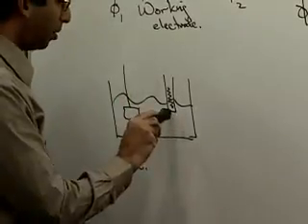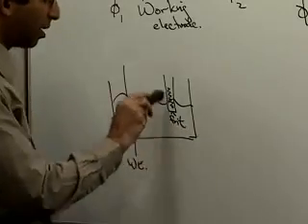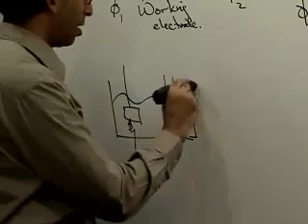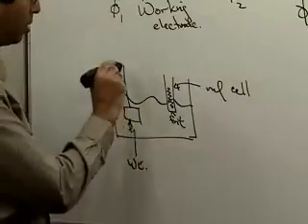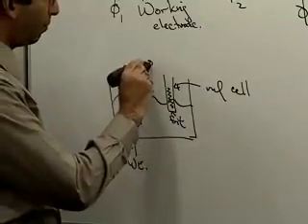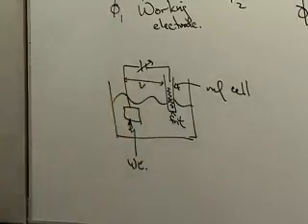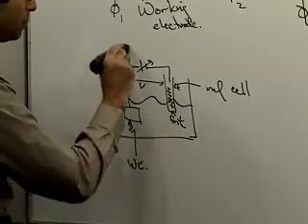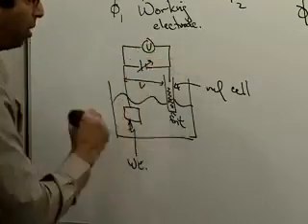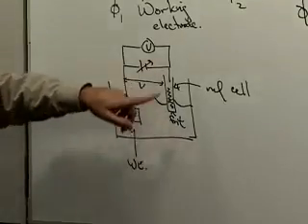And we will then put a little frit in here so that we can get ions to transfer between our reference half cell and our solution. And we'll apply our variable voltage power supply and drop a voltage across there. And now what we're going to do is we can now measure, we'll add a voltmeter in. We can measure now the voltage of this electrode versus whatever half cell I put there.